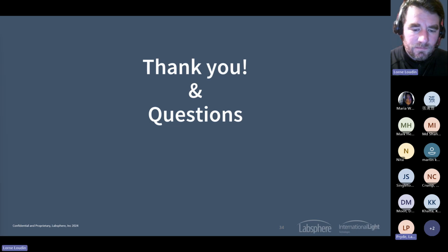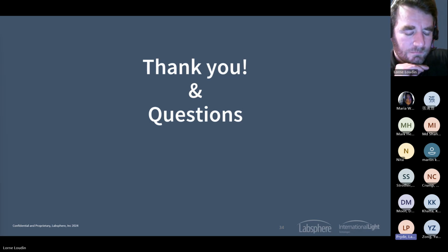Yeah, it does. It's just that my experience with LEDs, let's say you've made a spectroscopy instrument, and you have all these different LEDs with overlapping wavelengths to do your wavelength selection. What's the probability that any one LED is going to burn out? In real life, they burn out. You're building an instrument, and yes, you can take a big batch, pick LEDs to do what you want, and test them yourself. But once it goes into the instrument, I'm uncomfortable with it: if one LED burns out, what do I do? Then my whole instrument is off.